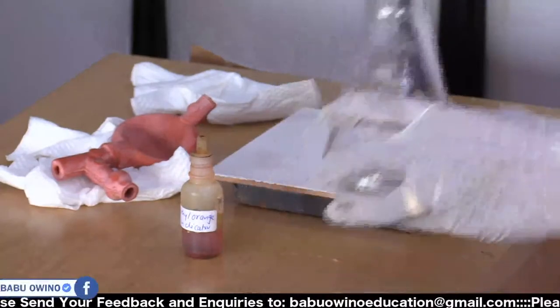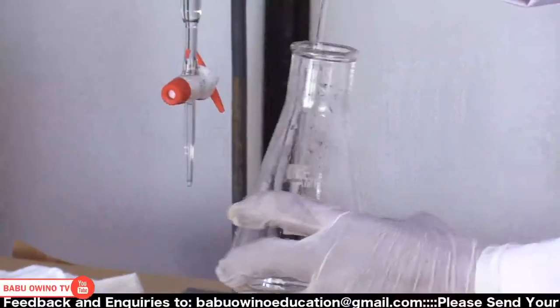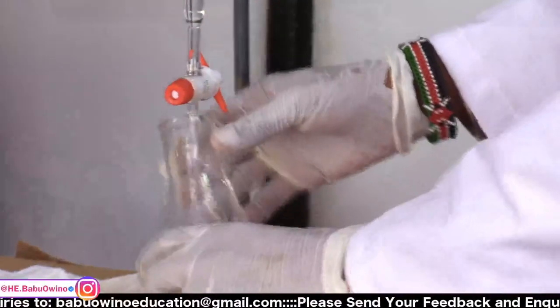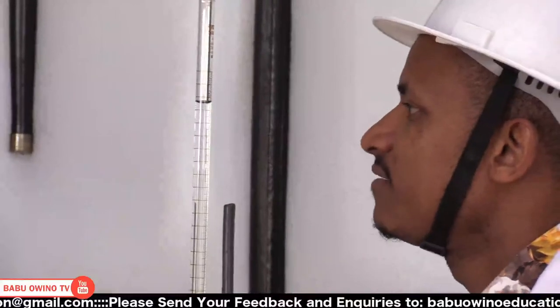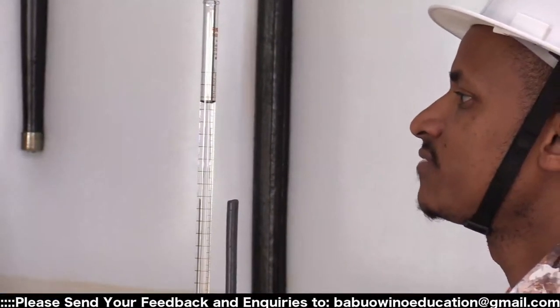Once again, when it starts doing that, you just tap the sides of the flask. So we'll move a little bit faster to save time. Then before that, we read our initial value. Our initial value is 2.5. In two decimal places is 2.50.